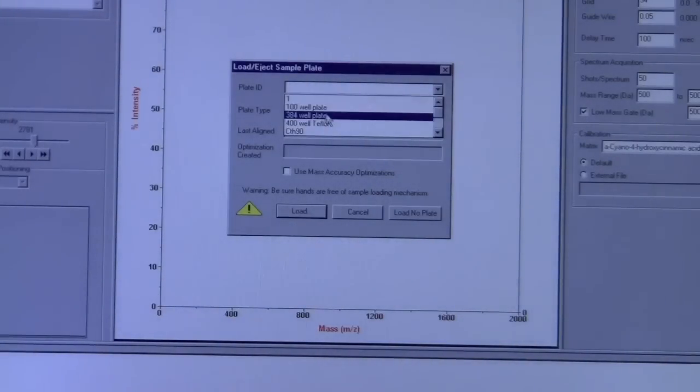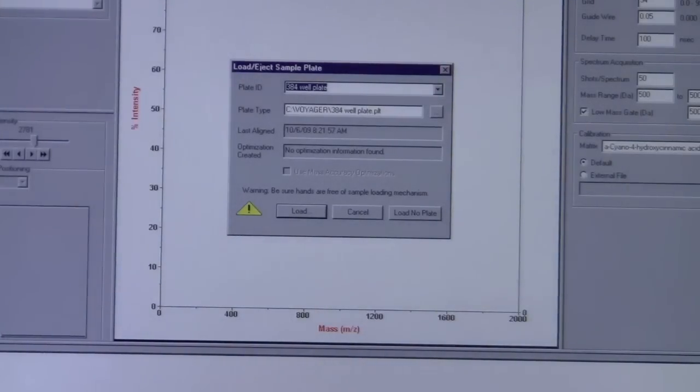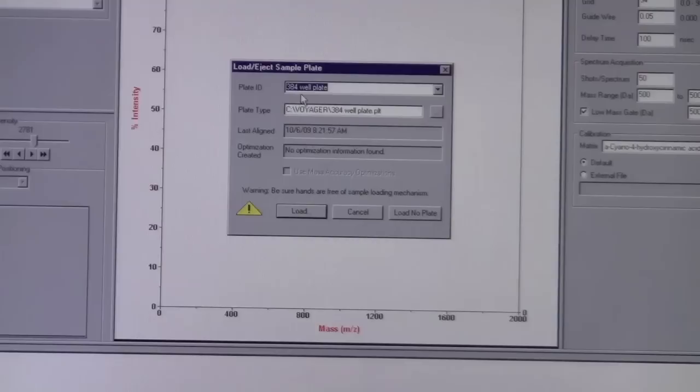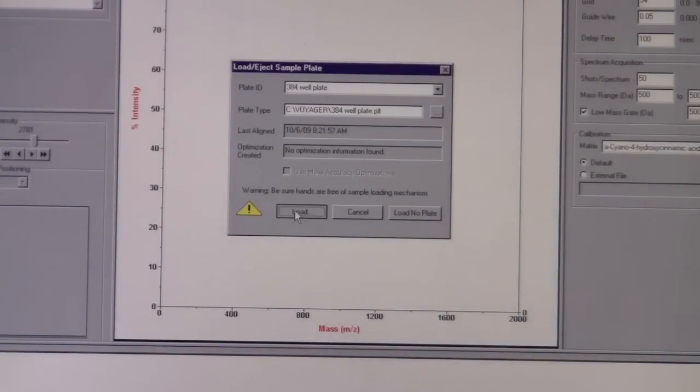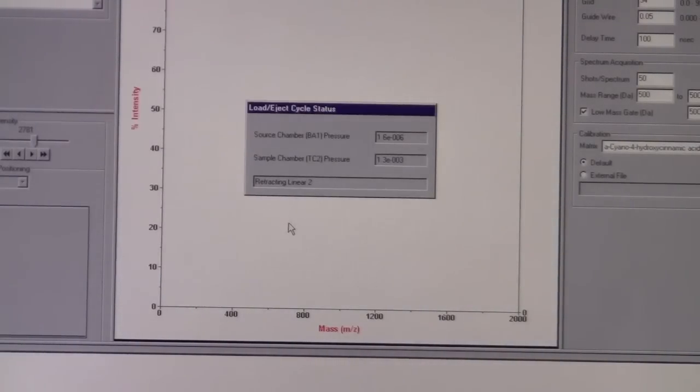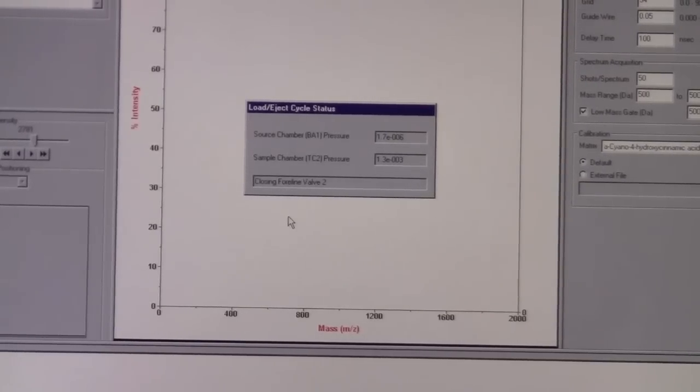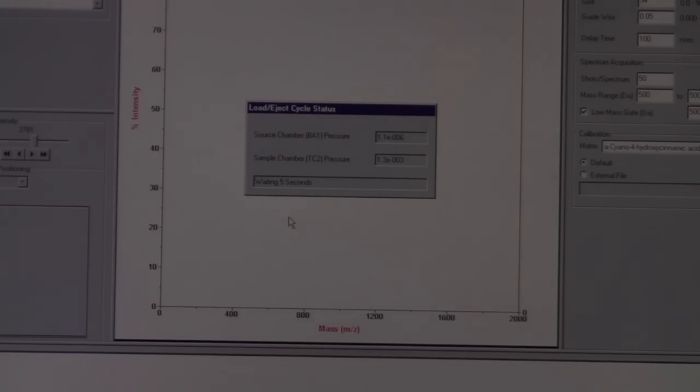This is not really critical, but what will happen is if you choose the plate ID, it will bring up a little map here, which will help you locate where your samples are on the plate after it has been loaded. So this one's a 384-well plate, and then I will select load. What's going to happen is it's going to suck the plate into the instrument, and again, this process will take a few minutes before the plate actually gets loaded fully into the instrument.